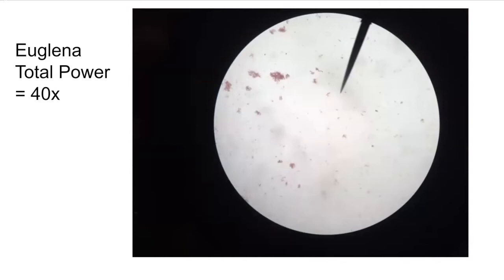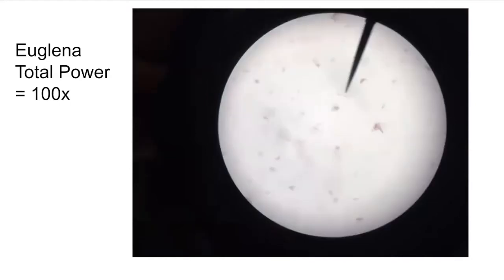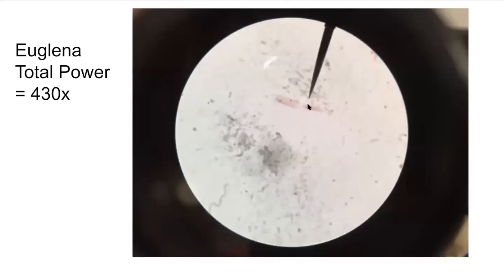If we look at the Euglena on low power, they appear red. But Euglena are really green — these lost their chlorophyll during the preservation process, giving them a pink color. Keep in mind, Euglena are photosynthetic and are usually going to be green. As we increase magnification, we see them get bigger and bigger. They are the smallest protists we're looking at. You can see they have a nucleus, and on the non-pointy end they have a flagella — a long tail that spins like a propeller and helps them swim through their environment.